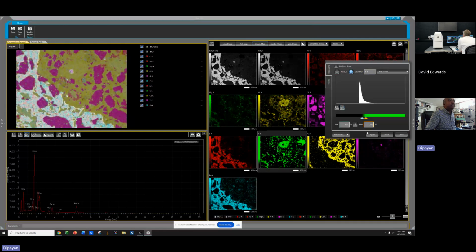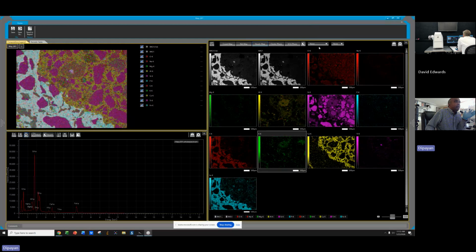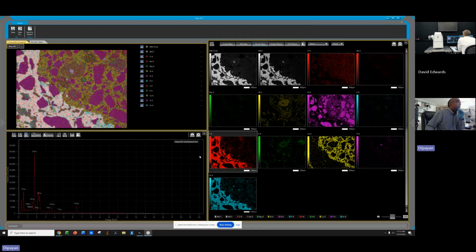Now if I do this, I can get a much better image, but it's not sharp though. Correct. It's not sharp because you're doing 3 by 3 averaging, so 9 pixels being averaged into one position. Of course it's not going to be sharp. It's going to round the edges. So the sharpest will be with no filter, right? Yep. The sharpest will be no filter, and then I can still play with the colors and bring them down. So that is a better approach to get the sharpest image.